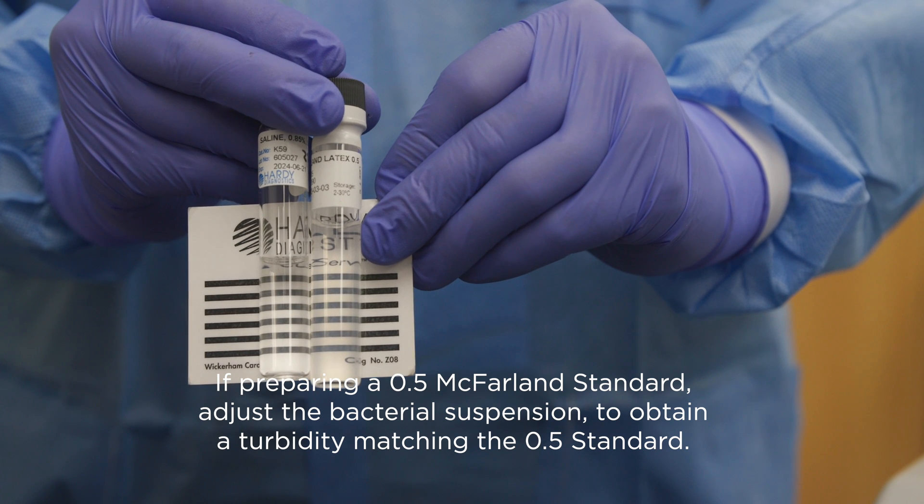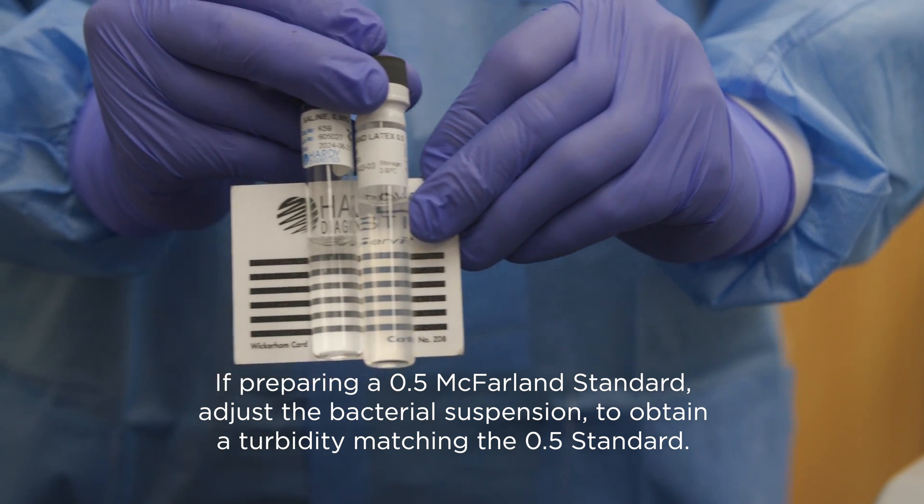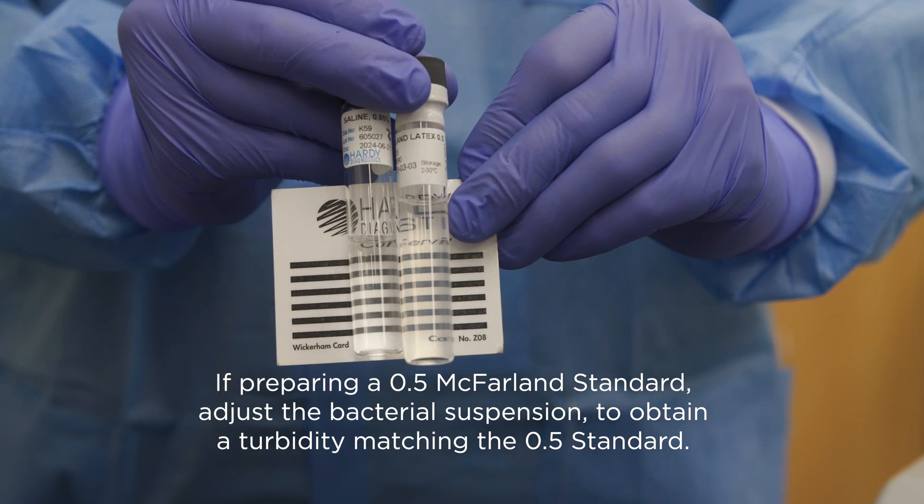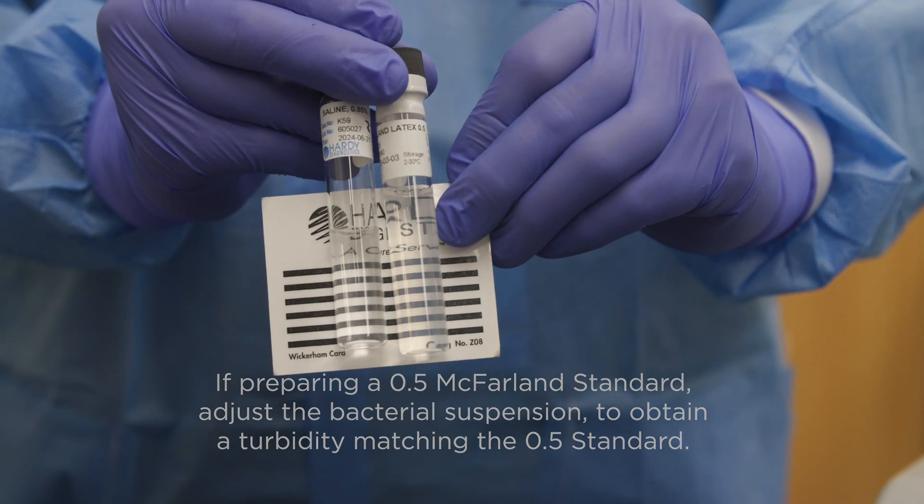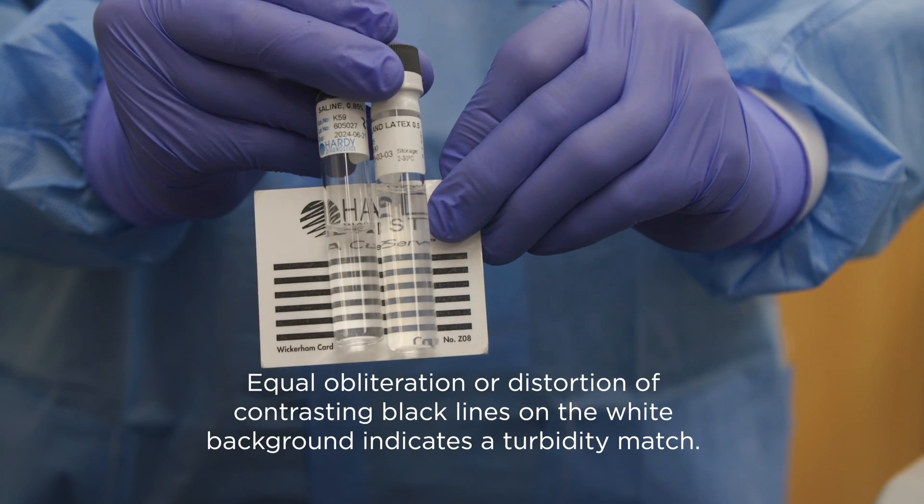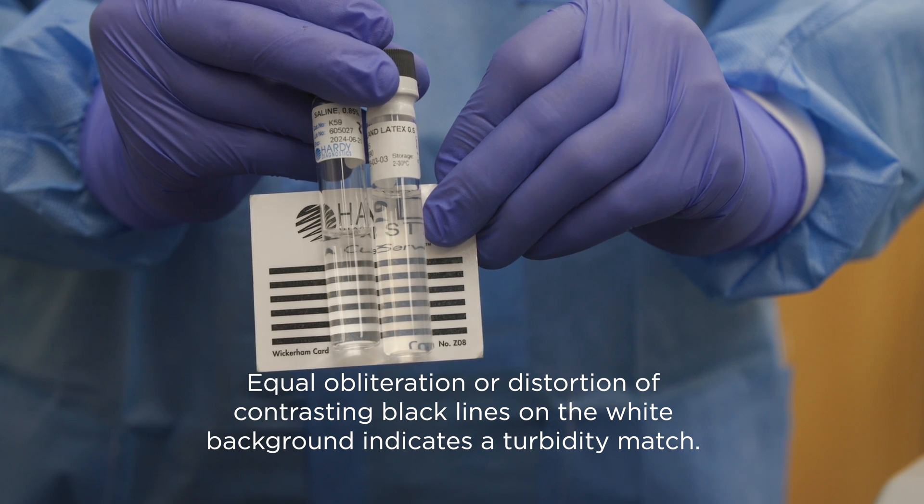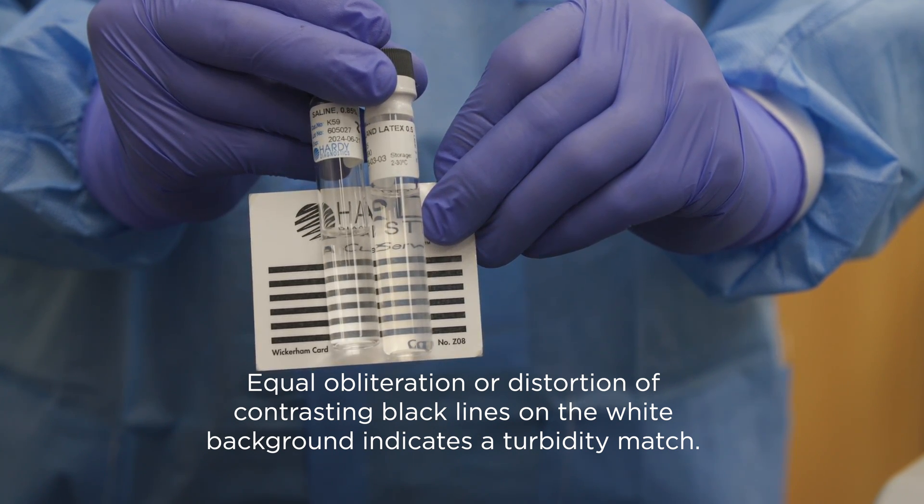If preparing a 0.5 McFarland standard, adjust the bacterial suspension to obtain a turbidity matching the 0.5 McFarland standard. Equal obliteration or distortion of contrasting black lines on the white background indicates a turbidity match.